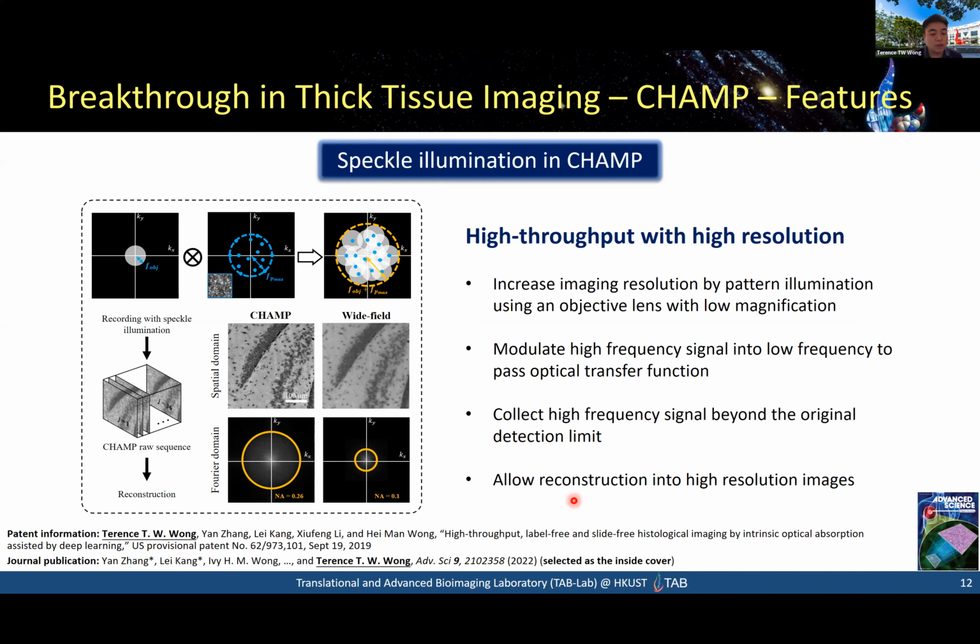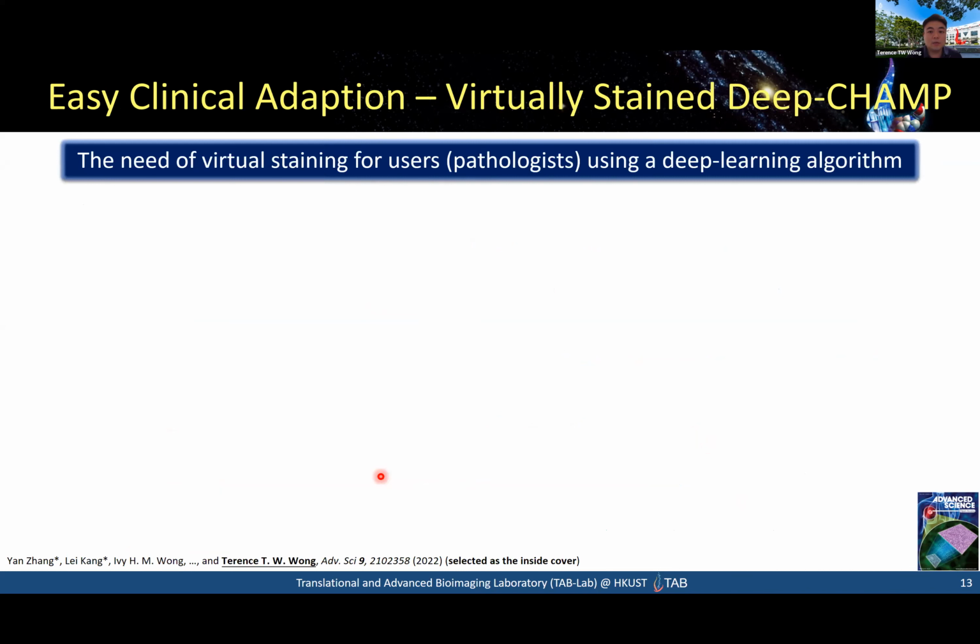And for sure, we need to reconstruct our images. We are collecting 36 images, and at the end provide much higher resolution, as you can compare these two. So the improvement of the resolution is about 2.6 times. And this is a very user-driven application because we're targeting histopathology, right? So our users are mainly pathologists.